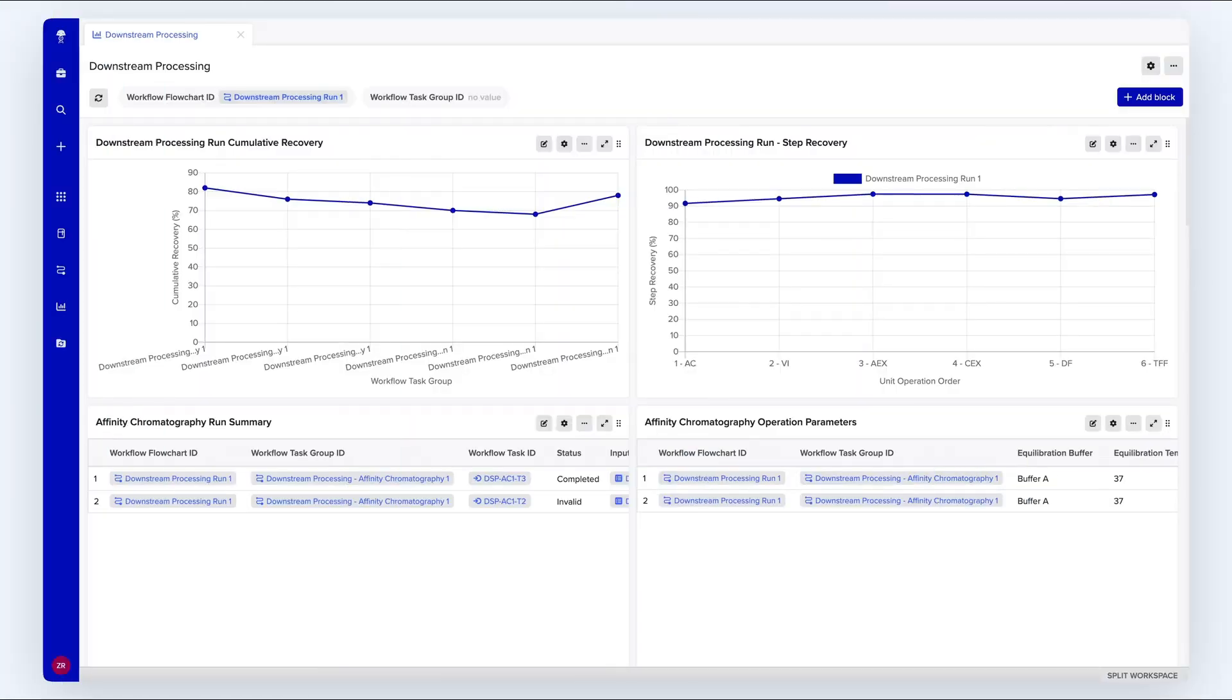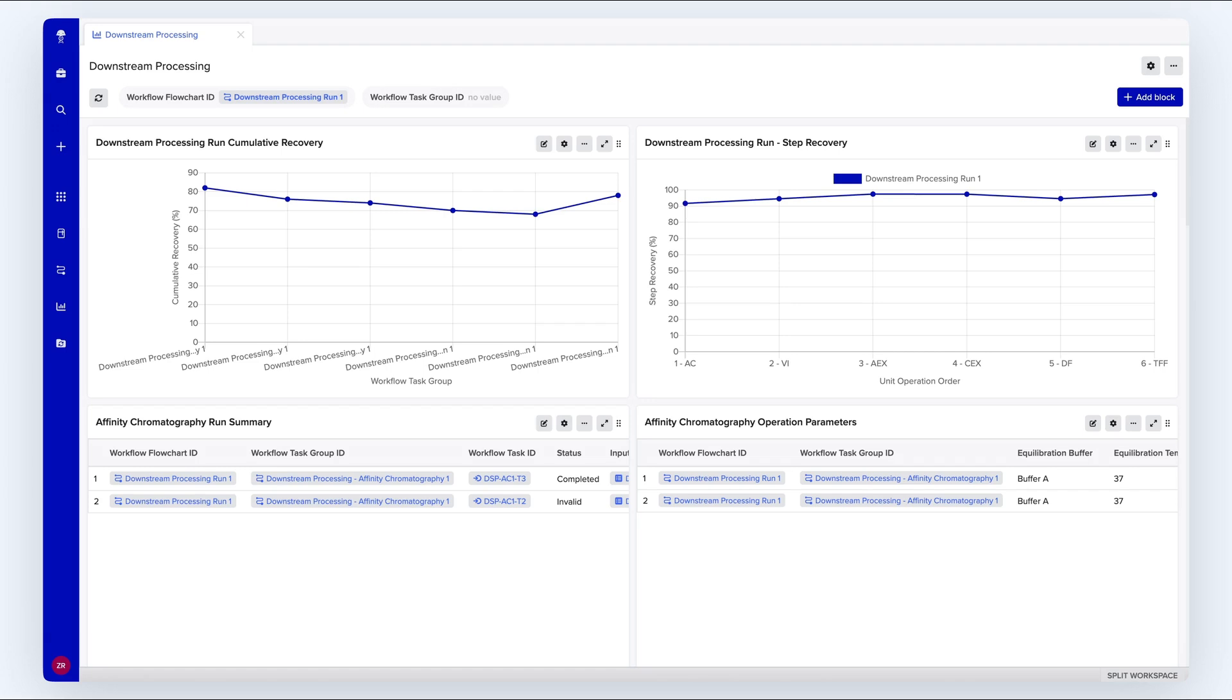The final step of any research workflow is data analysis. Benchling BioResearch helps scientists aggregate data across experiments, visualize data to draw insights, and share output across teams to make decisions.